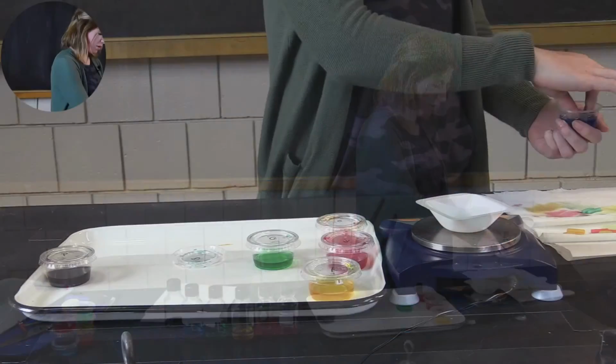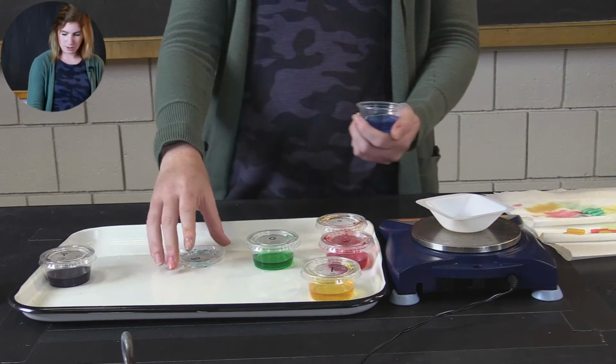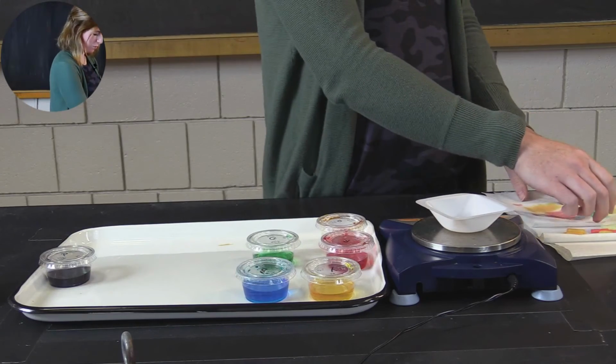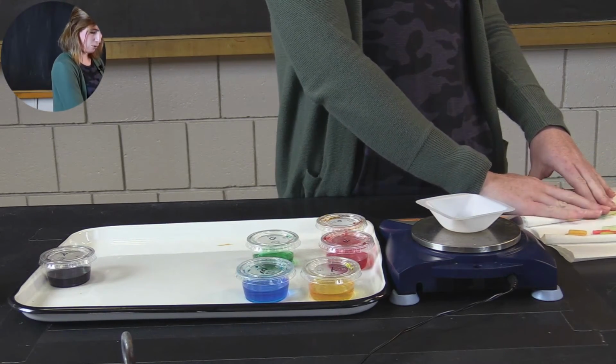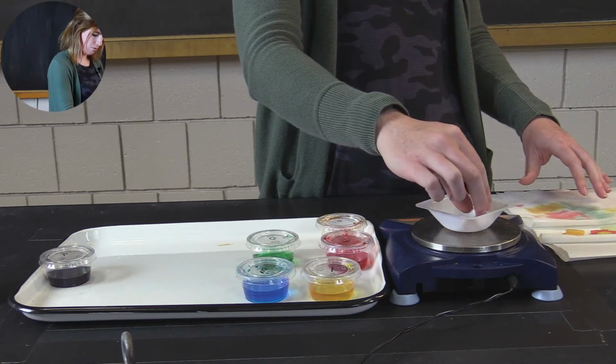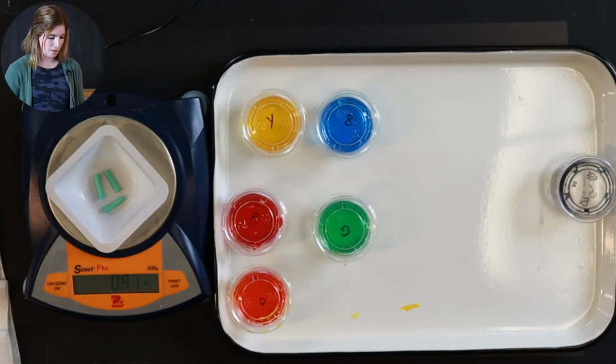Next I have my blue ones. These ones also look to be maybe a little bit shriveled up, similar to the ones in the yellow. And their final mass is 0.93 grams.